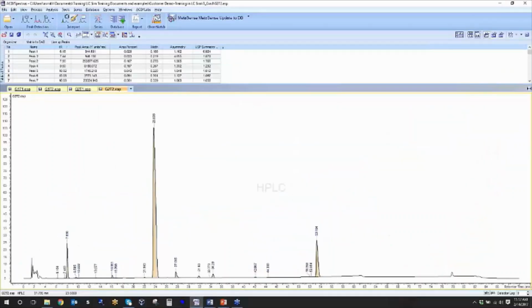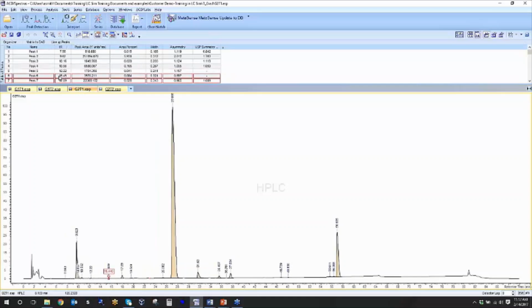So as Brent mentioned, one of the things that we do need for doing our optimization is to have peaks tracked within the software. Now, in this example, we can see that all of our peaks are labeled and that we have the corresponding retention times. If we move to a different sample, again, you can see the peak label and the retention time. Once this has been done, you can move forward with your optimization.